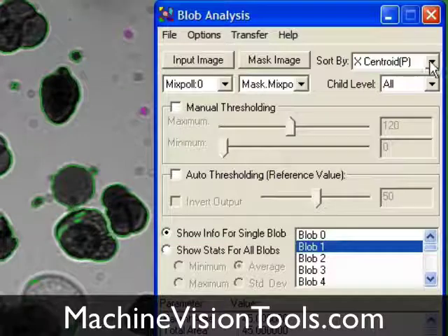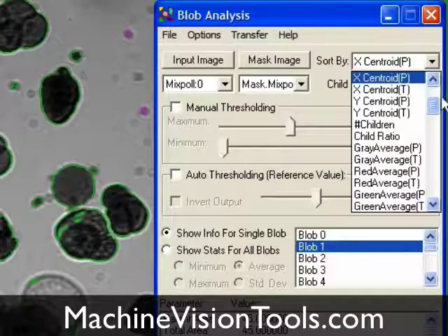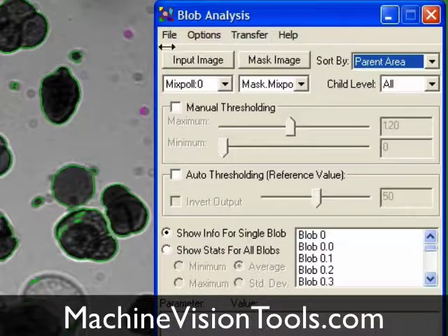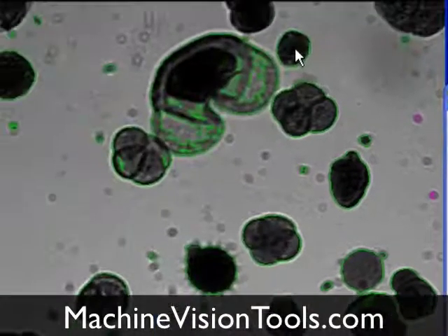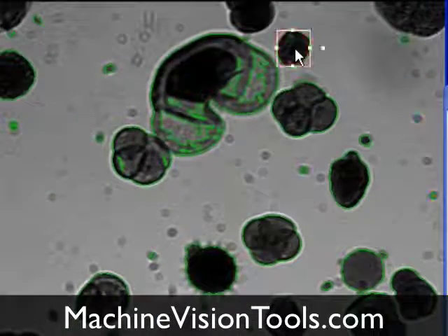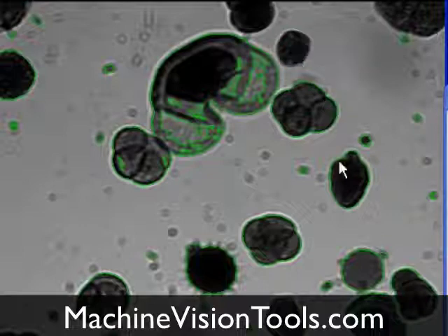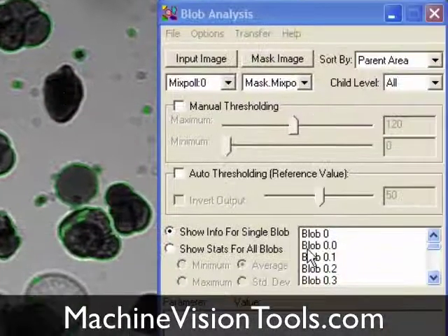But let's go back to sorting by parent area. If I want to delete a blob, I can highlight it by right-clicking it just like any other ROI, and then hit the Delete key on my keyboard. Any blobs that I delete are immediately removed from the blob list.